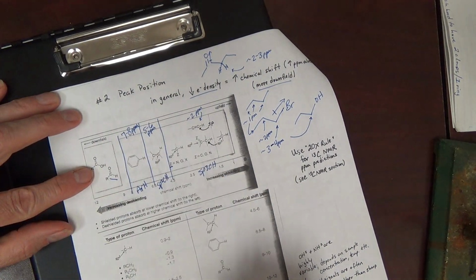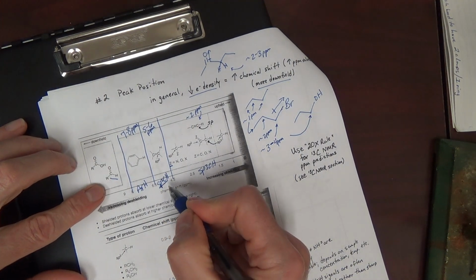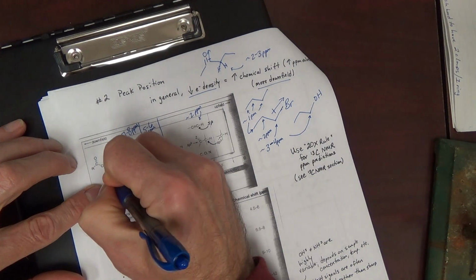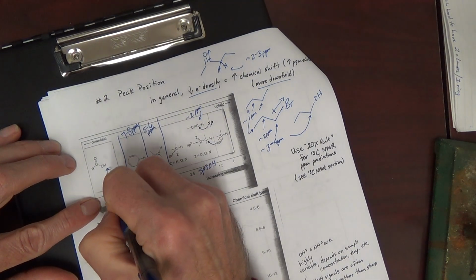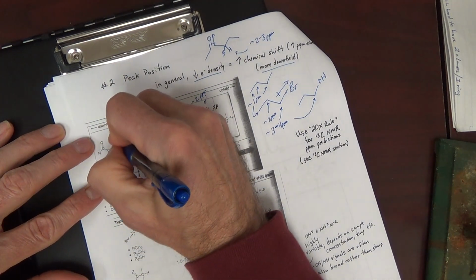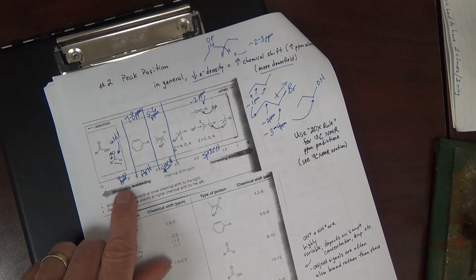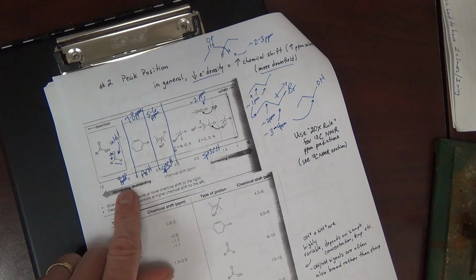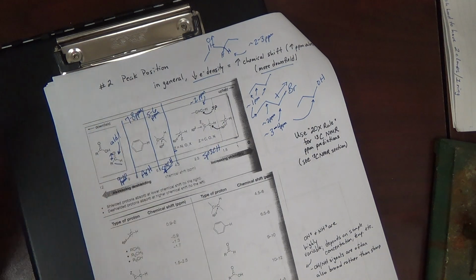Aldehyde CH. All right. It is an sp2 CH like this. But because it's also got the electron withdrawing group, aldehyde CH is about 9 to 10 ppm. Aldehyde. Typically 9 to 10, your aromatics are not going to be that far downfield. So it's a unique region which is usually, if you see a peak there, it's going to indicate an aldehyde. Of course, not always.